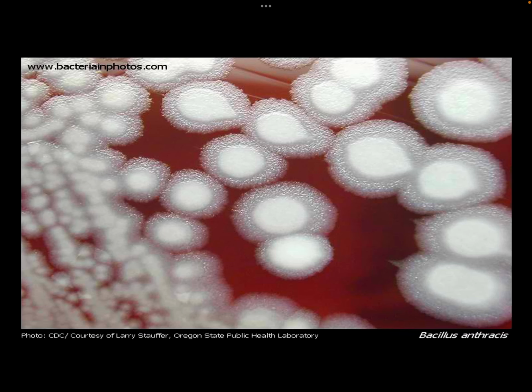Okay, this one, this is the colonies. These are the colonies of Bacillus anthracis. As you can see there in the agar plate, they are usually non-hemolytic. And aside from a medusa head description under the microscope, you can see in the book that sometimes it's referred to as dry ground glass surface. Okay, ground glass, the colonies are dry ground glass surface.